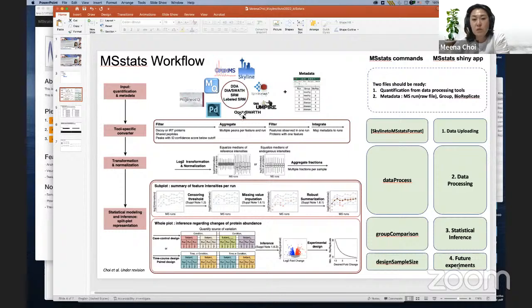So these processing tools can do processing, identification, and quantification, et cetera, for all the runs, but we need experiment design information. For example, for each MS run, which sample it is from. Which sample means disease sample one, patient one, or healthy patient two, et cetera. This we cannot get from our processing tool. This is what the researchers design. So we need to separate the metadata.